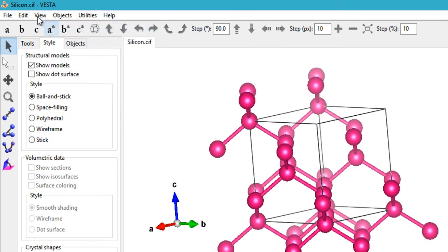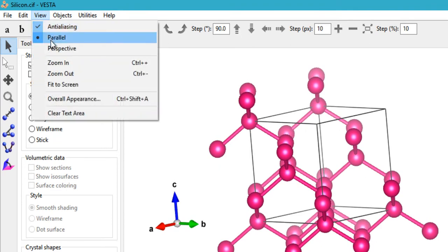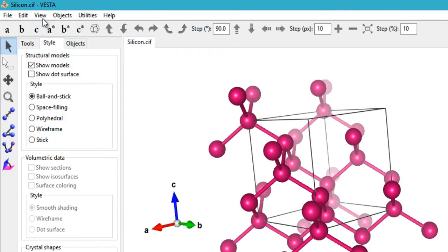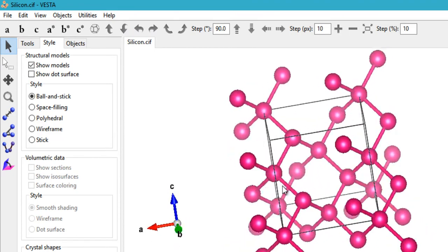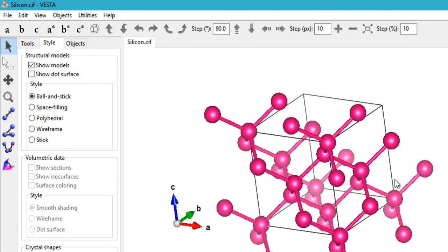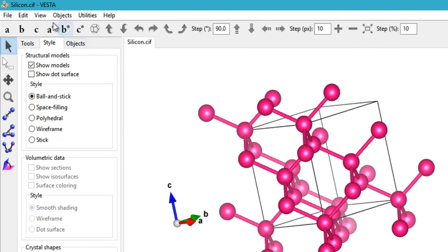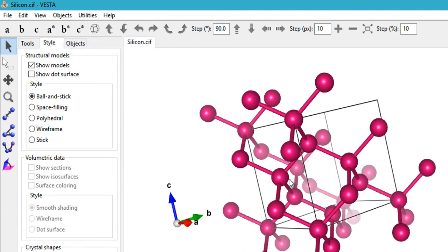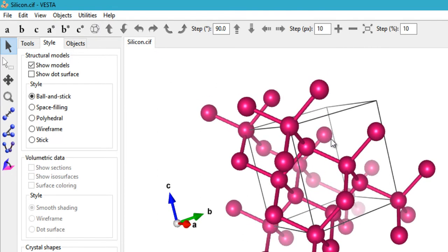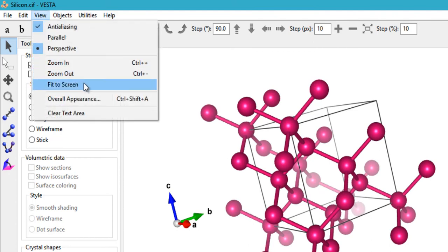Under View you can change the camera mode — I prefer perspective mode because it shows which atoms are in front and which are in the back, compared to parallel projection. You also have zoom-in, zoom-out, and fit-to-screen options in the View menu.